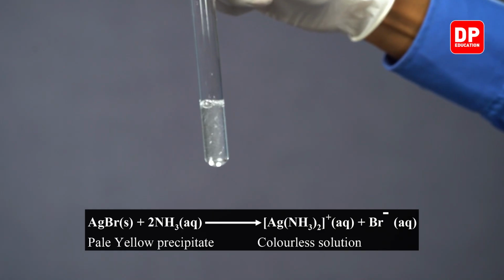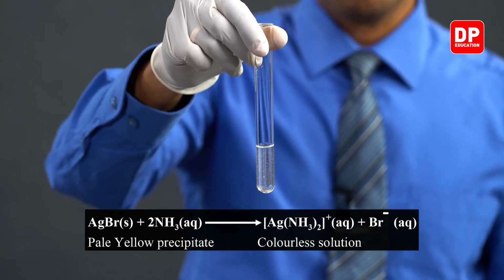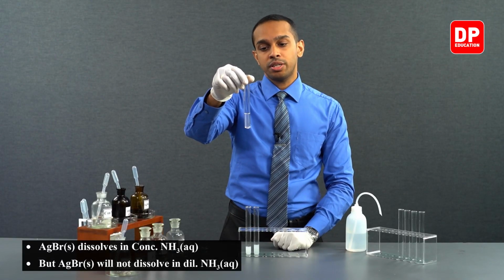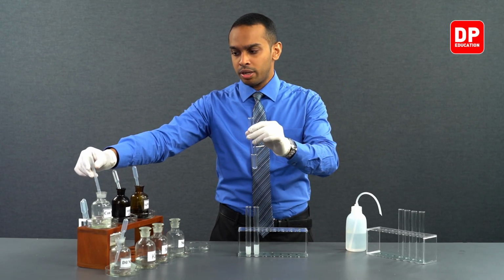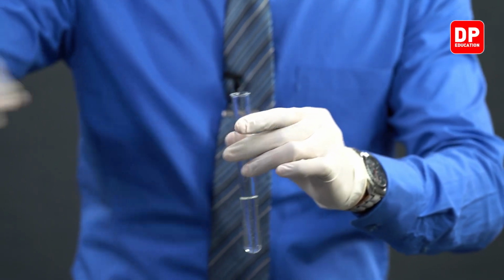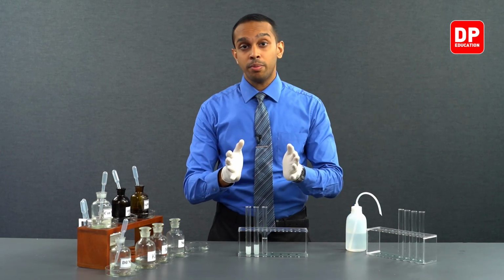you will see all of the solid that was present over here is now dissolving in concentrated ammonia. So silver bromide is soluble in concentrated ammonia. We'll add a little bit more just to make sure that every particle here is completely dissolved. Right. So we'll leave it aside for a while, and then we'll move on to the summary of what we learned here.